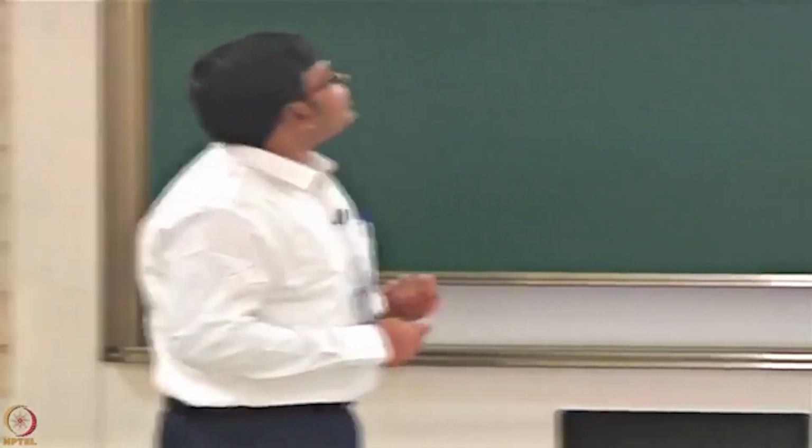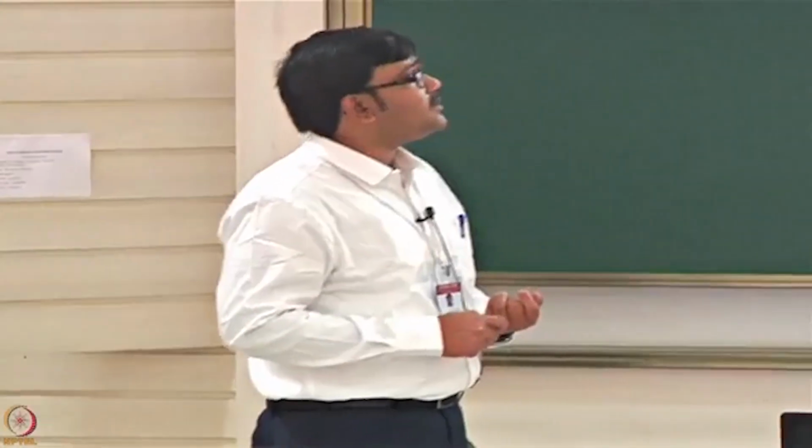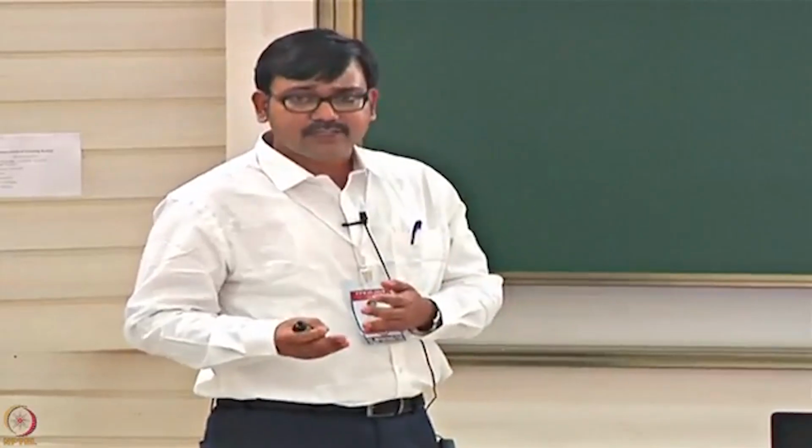So it will determine relative quantification. You can do relative quantification either label free or with labeled reactions like TMT, SILAC, iTRAQ.